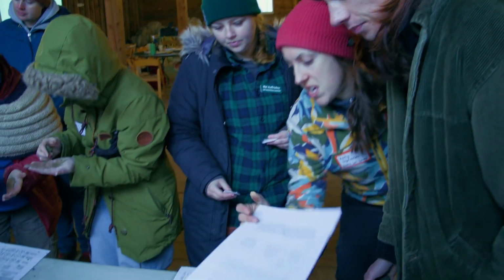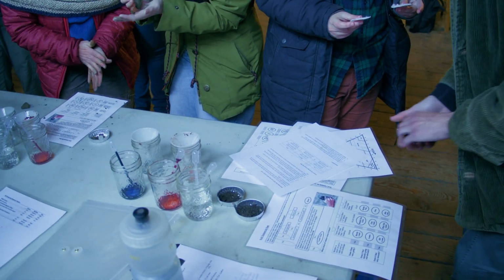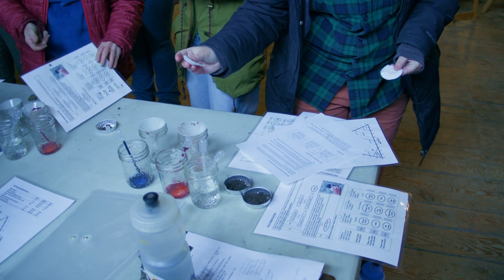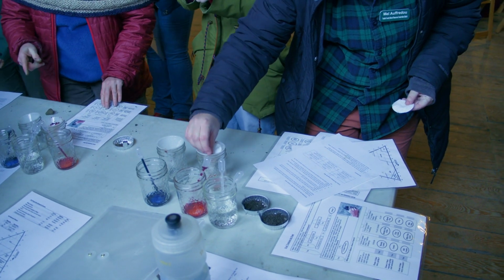It's half and half, equal parts. Make a little indent with your finger. Place one half in the bottom of each of the two funnels.